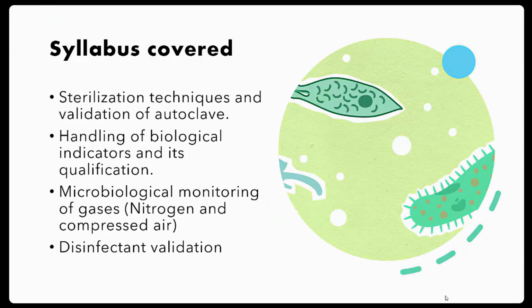Sterilization techniques and validation of autoclave. What is sterilization? Sterilization means removal of all living organisms. There are different types of sterilization techniques. Those are chemical sterilization, heat sterilization, radiation, and filtration. Generally used methods are heat sterilization and filtration in the pharmaceutical industry.